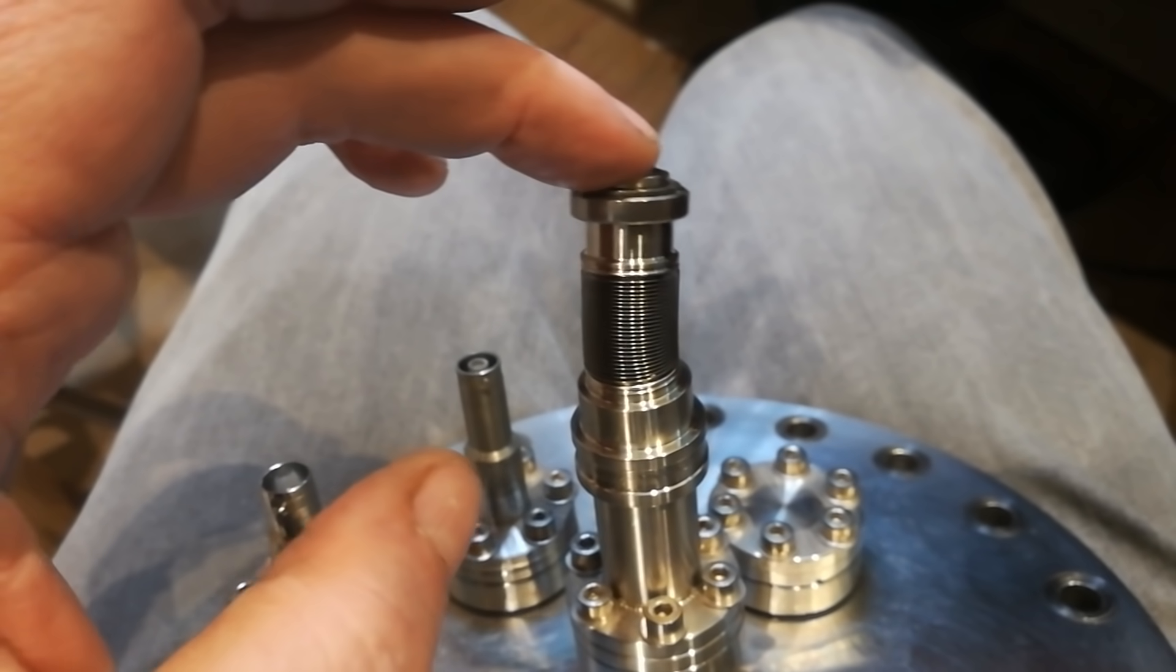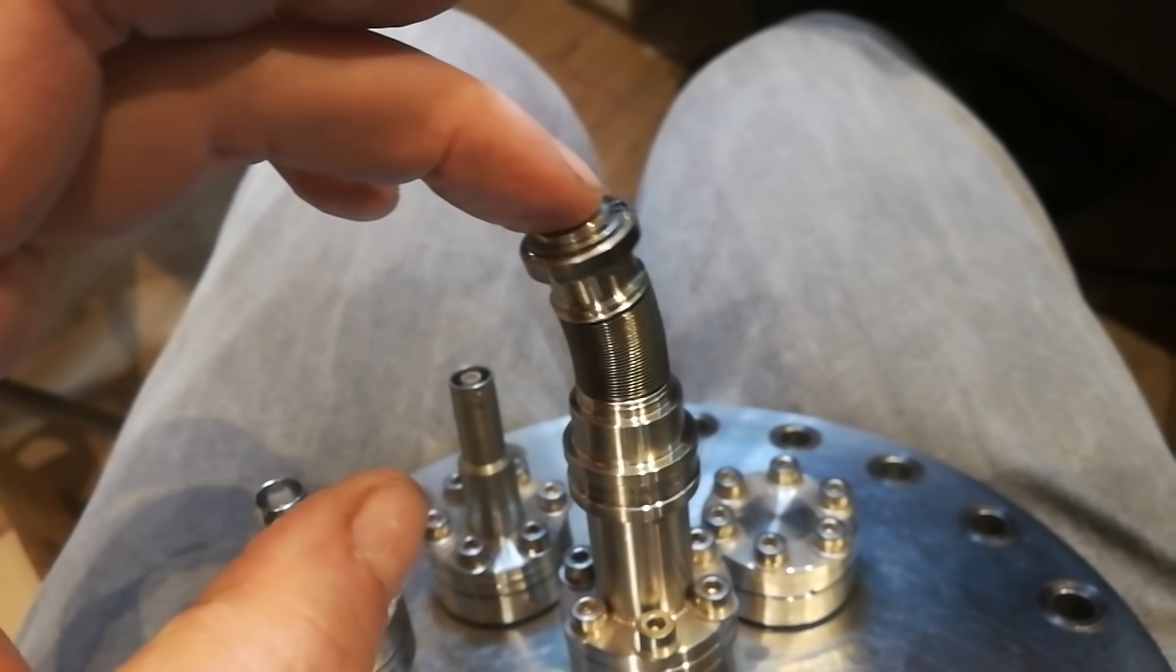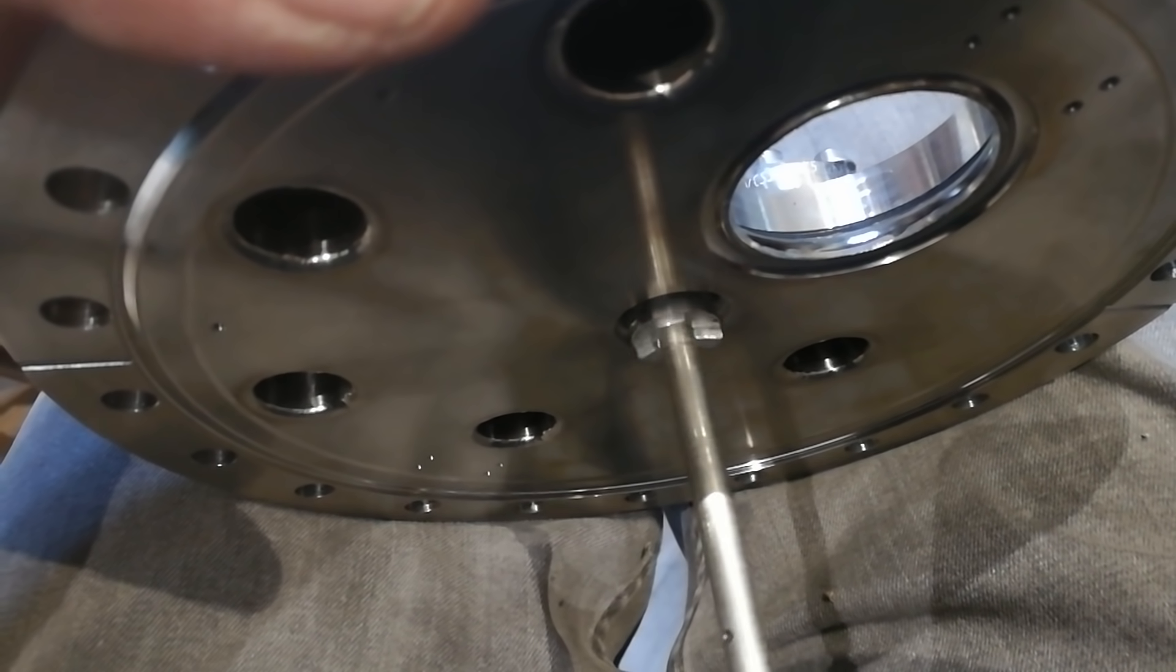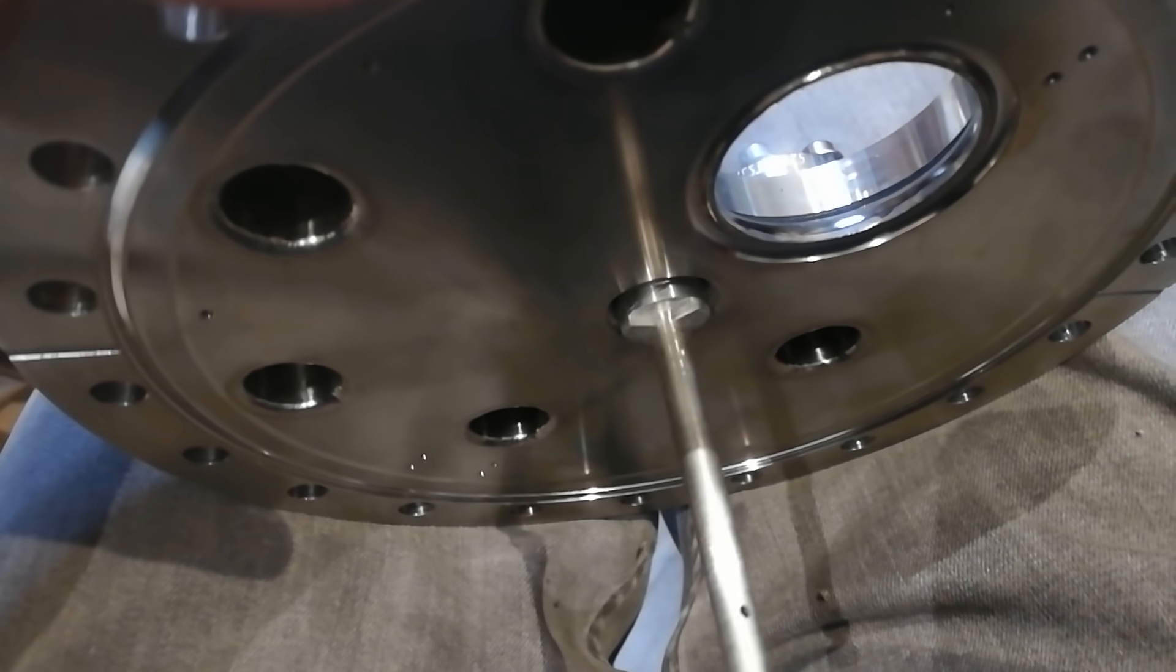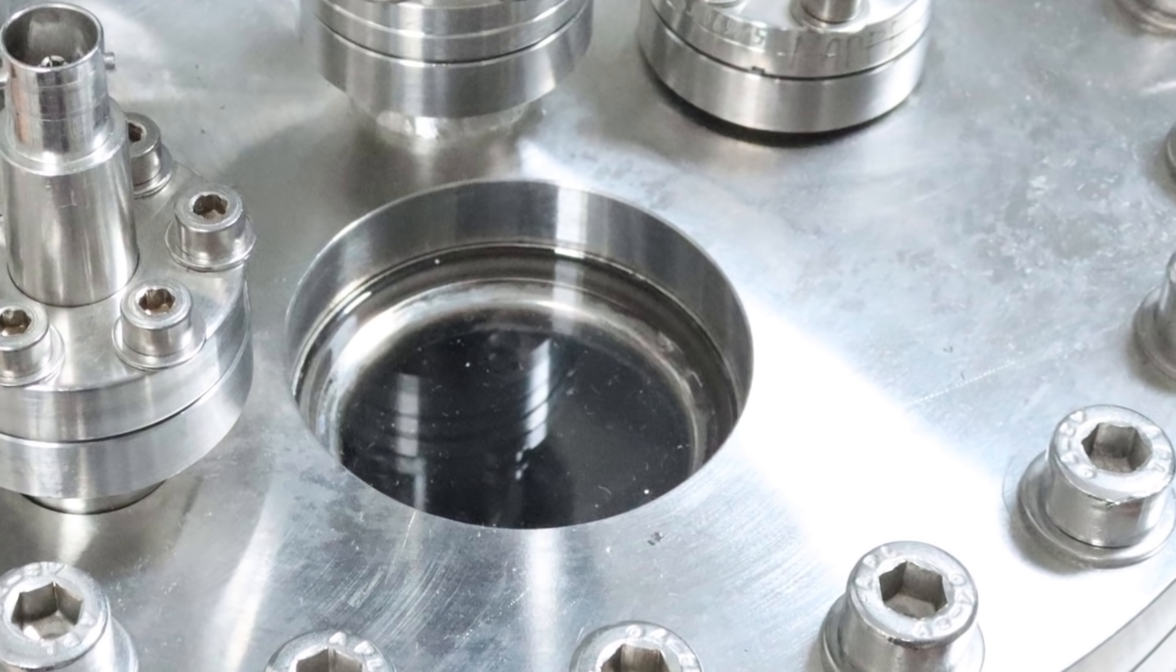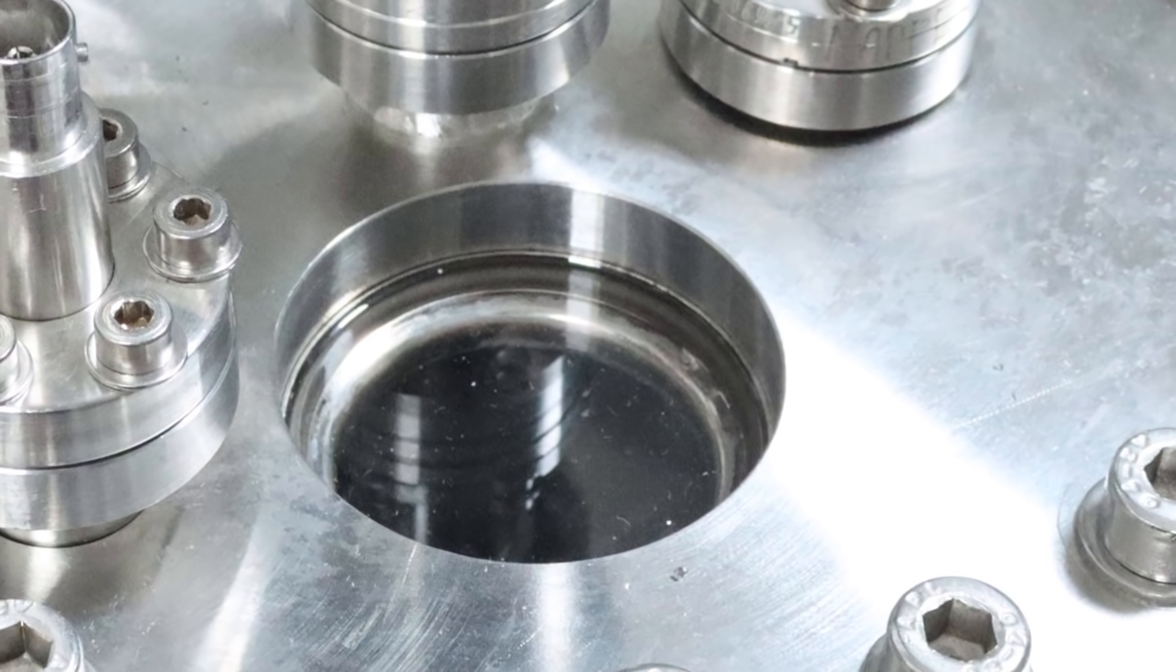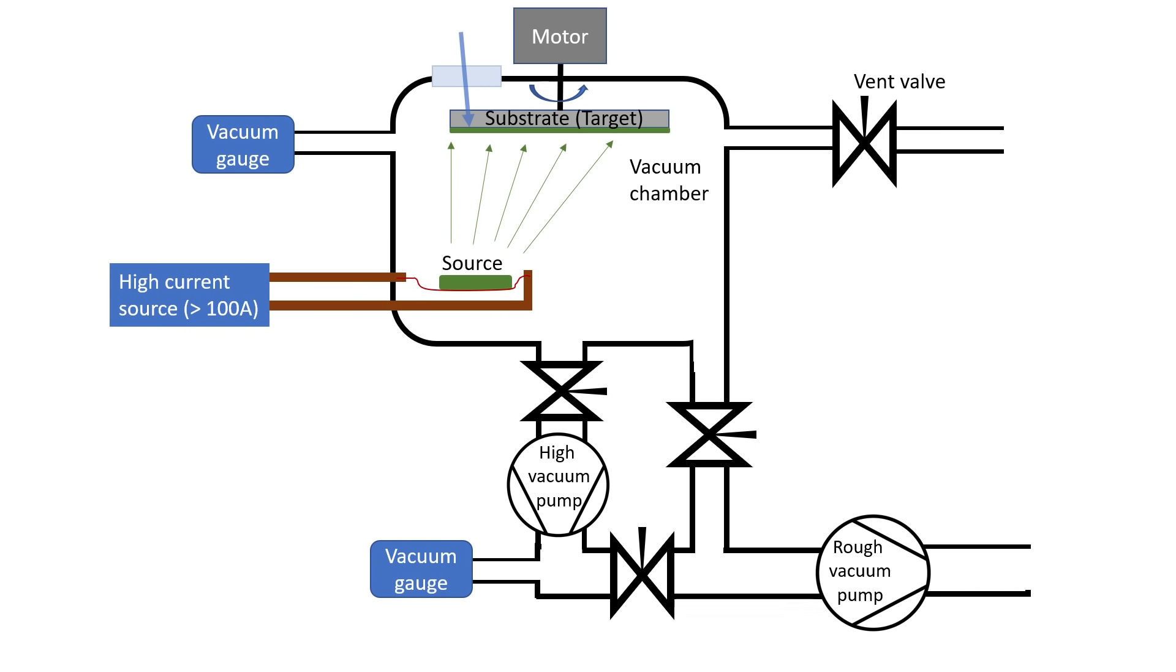Another piece of functionality is a rotation mechanism that can either be used to achieve a better layer uniformity or can serve as a shutter. An optical window allows for monitoring of the optical properties of the layers while evaporating. And for configurations where that is not really feasible, for example because the substrate is non-transmissive, I also added a quartz microbalance to the chamber.